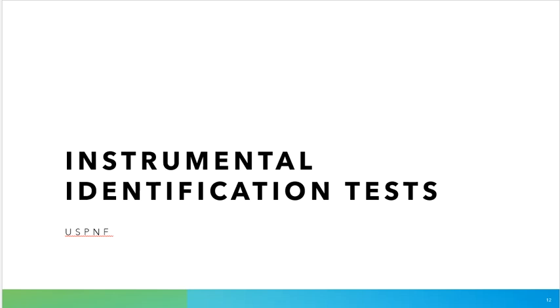Woohoo! We're back. Identification test. Yay! How exciting can this be? So in this lecture video, we're going to focus on the instrumental identification test. This is the equipment-based version of what should be a very quick and easy chemical identification test.